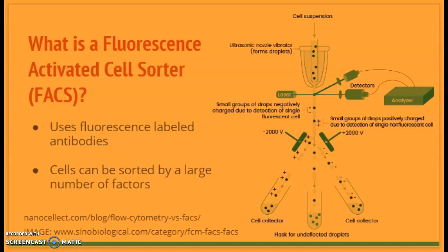So depending on what they're looking for, it can be adjusted. You can see here in this image that the flow cytometer machine is used to suspend cells or other particles in a liquid stream, same as before, and passes through a laser. The interaction with the laser light is measured by an electronic light detector apparatus as light scatter and fluorescence intensity. If a fluorescent marker is bound by a cellular component, the amount of fluorescence intensity will represent the amount of that particular component in that particular cell.